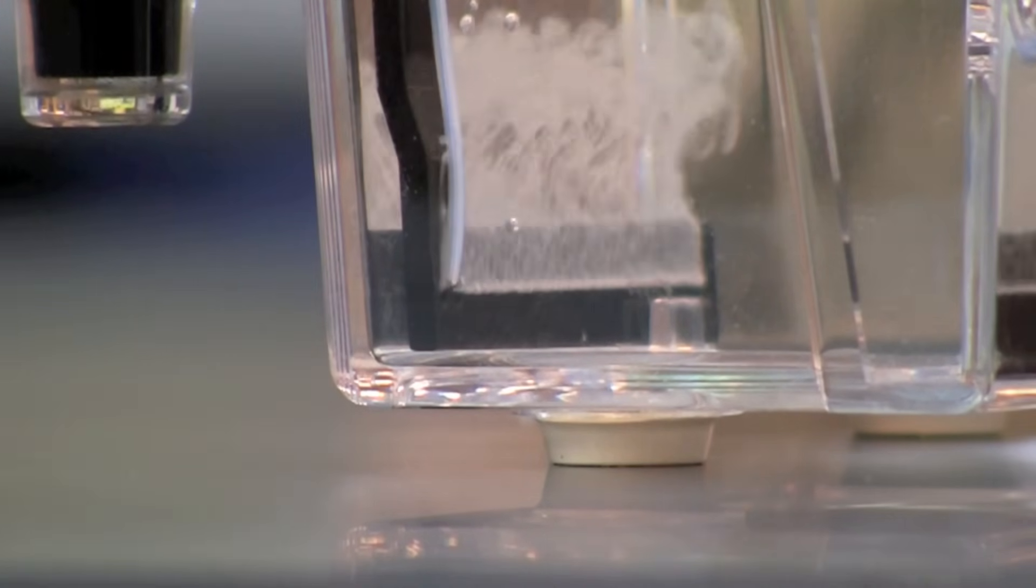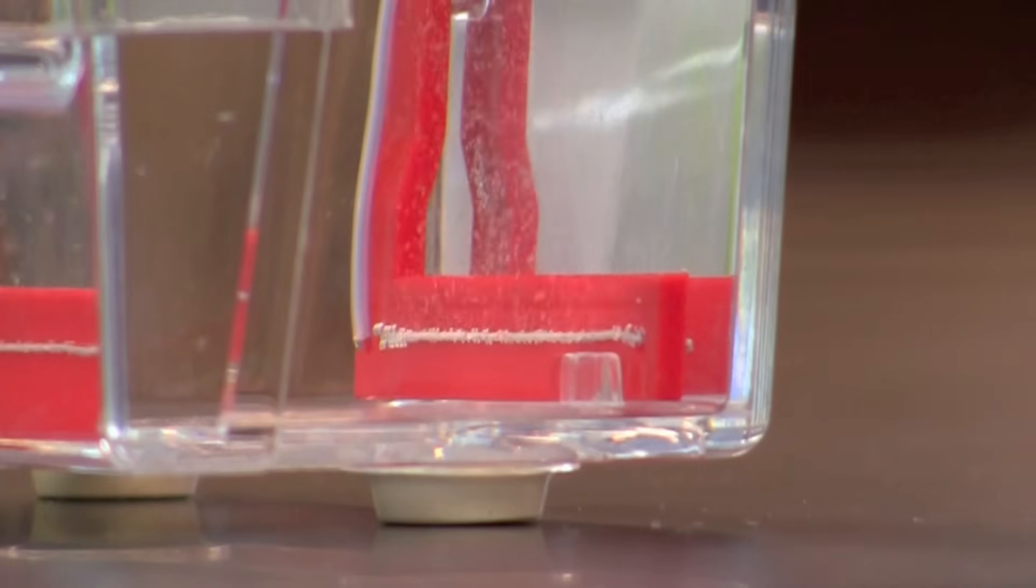At this point, you should be able to see bubbles coming from the wires at each end of the gel box. Notice that the positive or red electrode has fewer bubbles than the negative or black electrode.